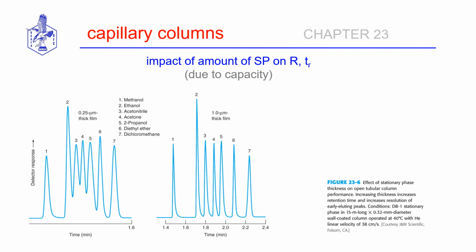The other consideration is the amount of stationary phase material coated on the inner surface of your column. So that has to be considered in purchasing and the options therein. So once again, if we want a clean separation, here's the surface of the silica support, and we have coated on the surface of the silica support our stationary phase.